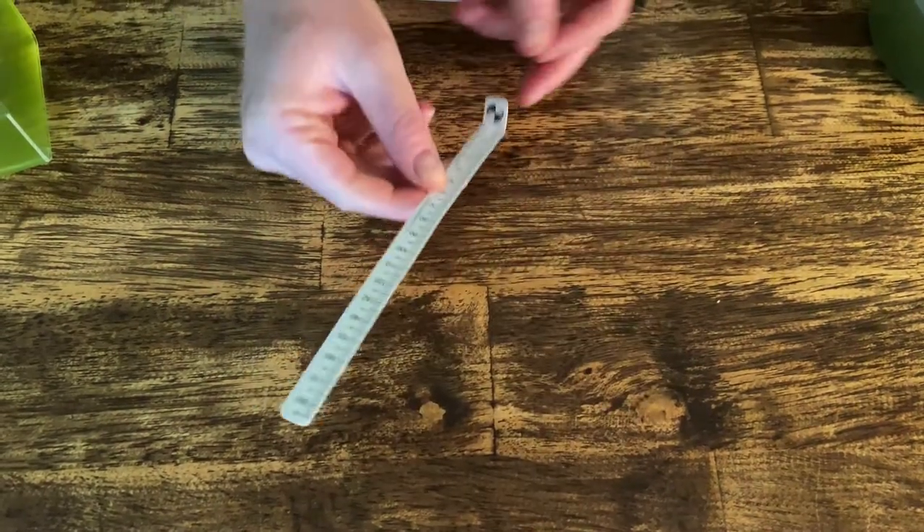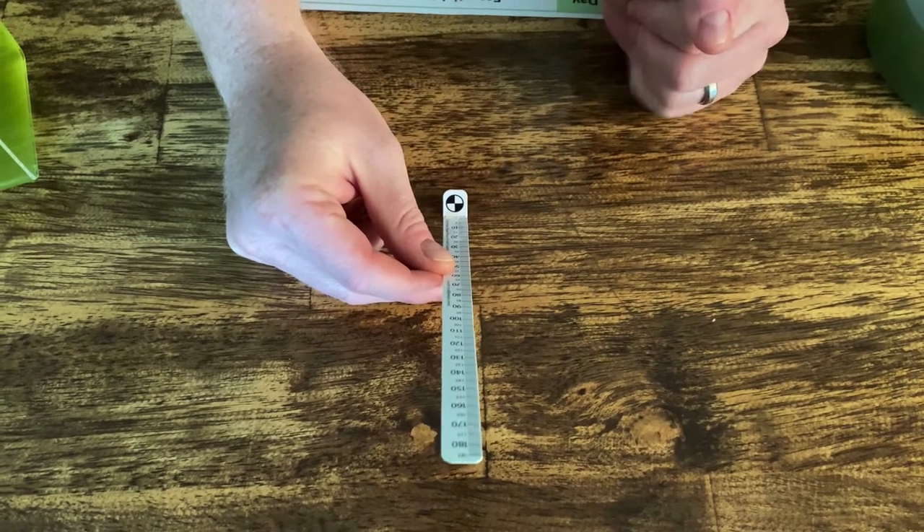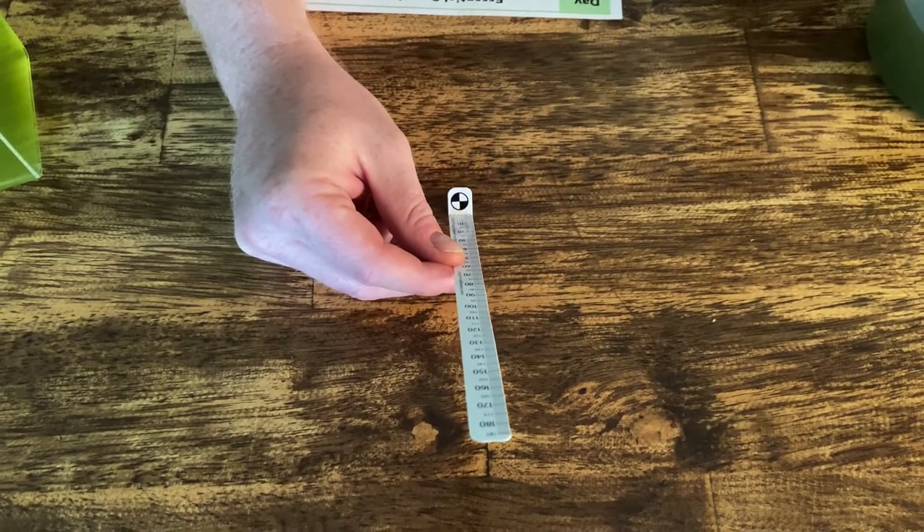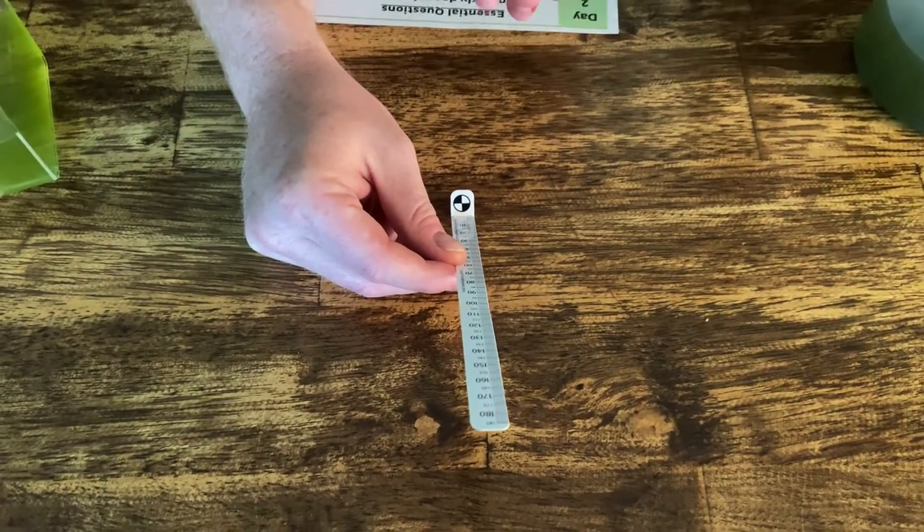The second part here is what we call the shield. This black and white circle is what we'll keep an eye on as we drop the SecchiStick down and lower it into the algae sample. We're going to watch that shield until it disappears.